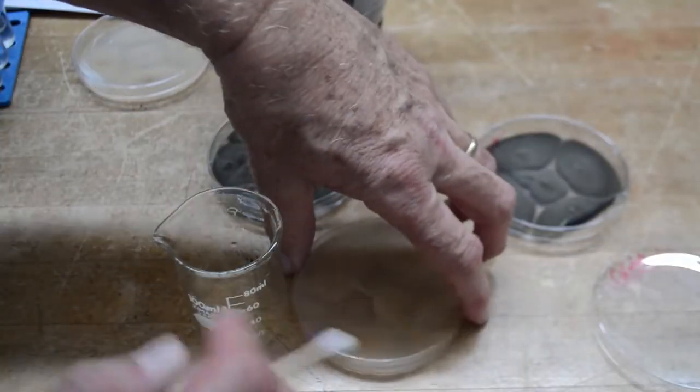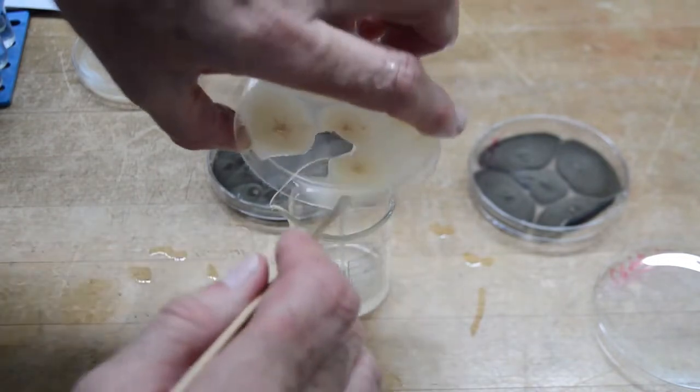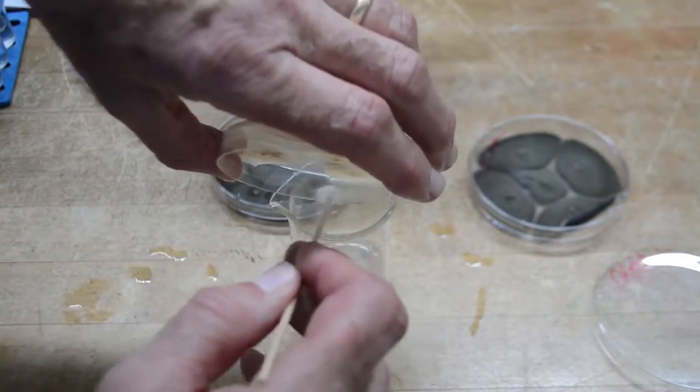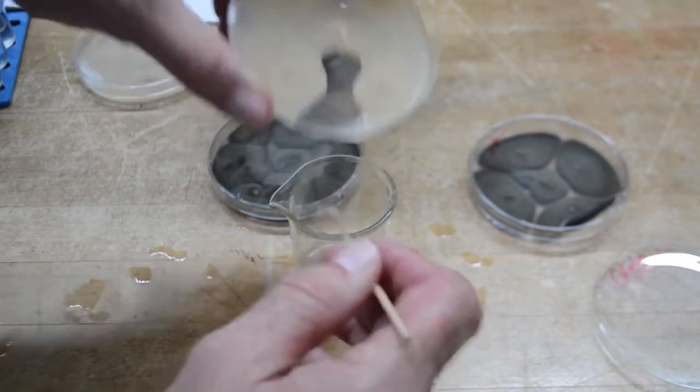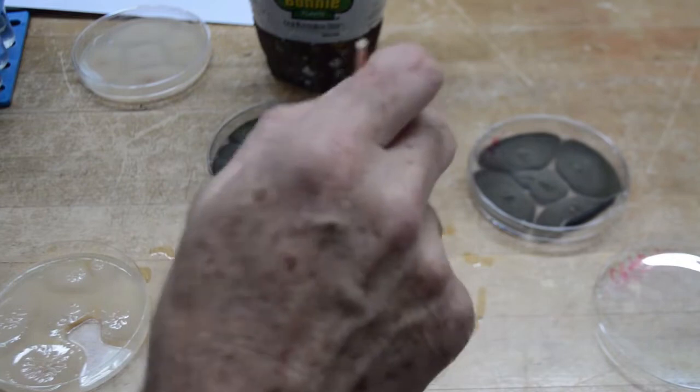The suspension of spores is then transferred to a beaker. The concentration of spores could be determined or modified at this point. When the water was added, it was clear. Now the suspension is turbid from the amount of spores that were harvested.